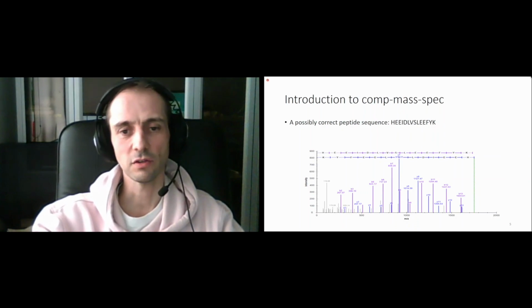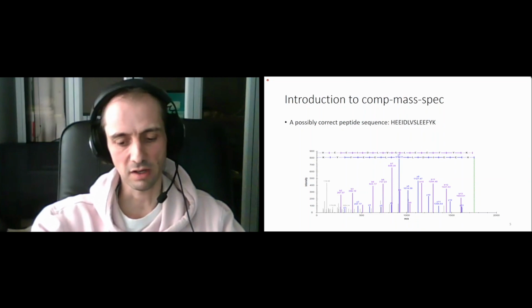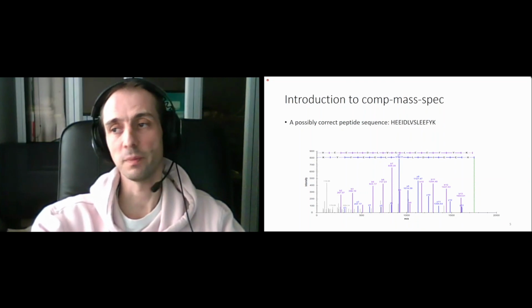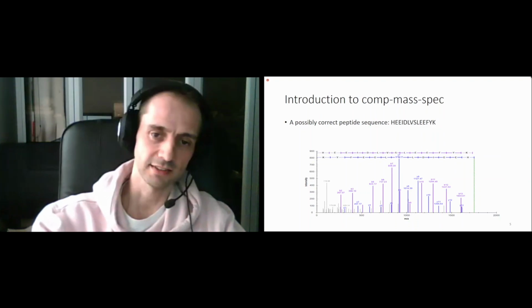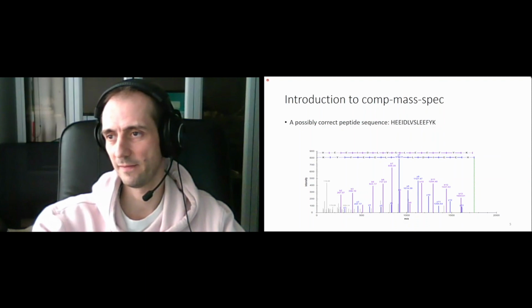One way is to use statistics to validate the results. Another approach is to use specific experiments to validate the statistical results, to make sure that they work properly.